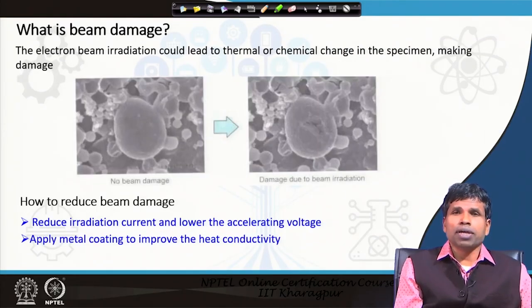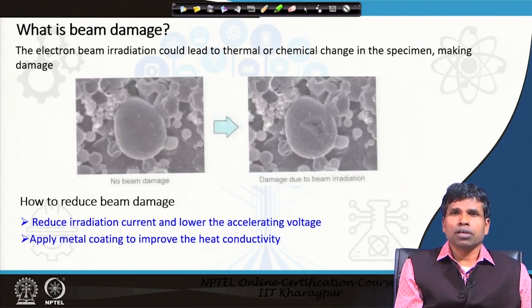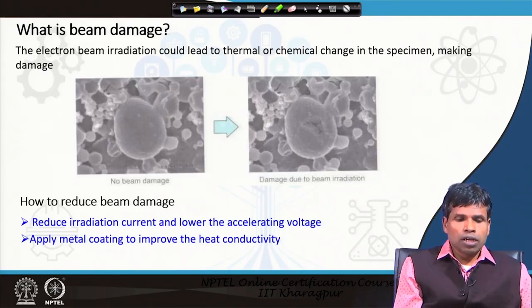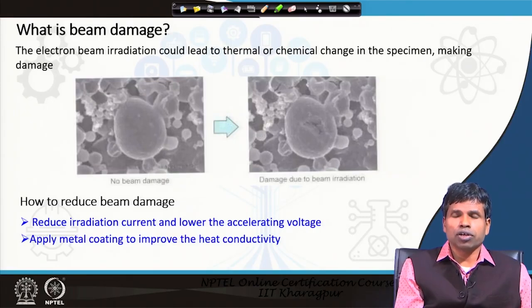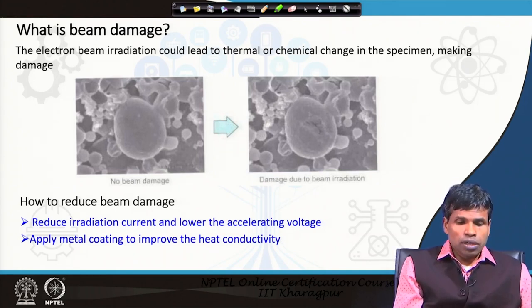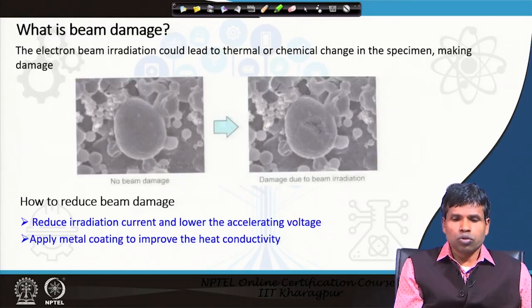Beam damage can also destroy the image. Electron beam irradiation can lead to thermal and chemical changes in the specimen. This is particularly strong when the specimen is a soft sample, such as a polymer or biological sample — then beam damage is aggressive. In order to reduce beam damage, irradiation current should be reduced and a lower acceleration voltage should be applied. By applying a lower acceleration voltage, the energy of the electron beam is low, and therefore we will do less damage to the sample.